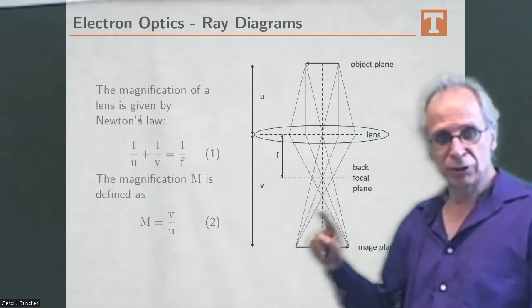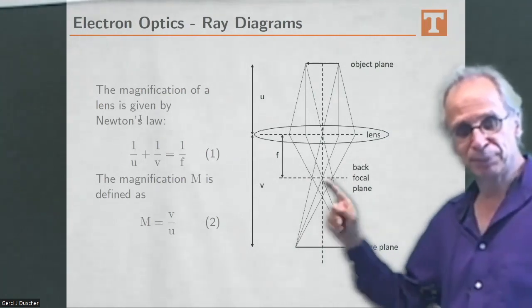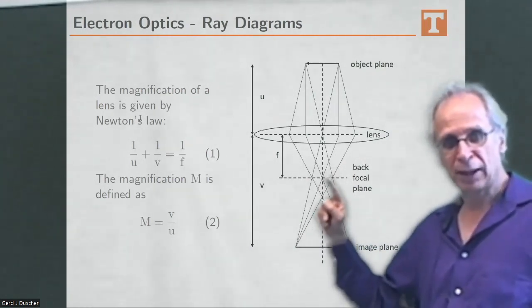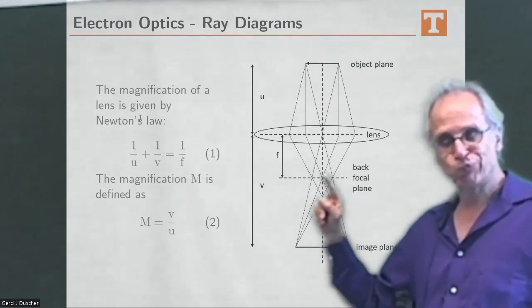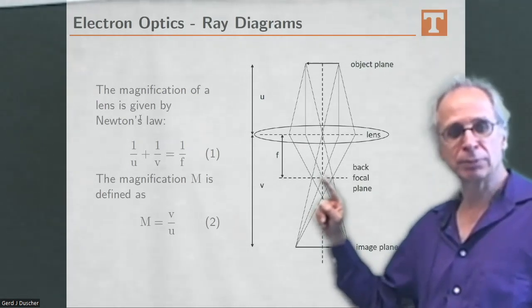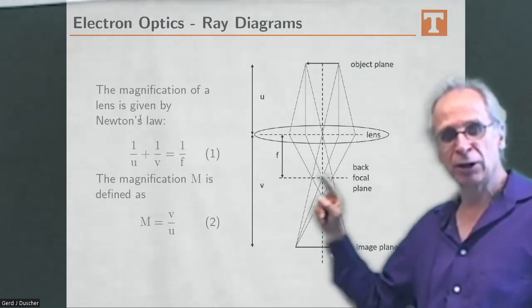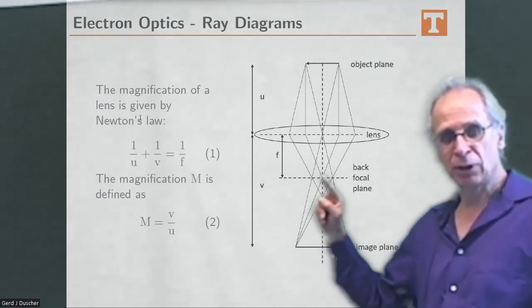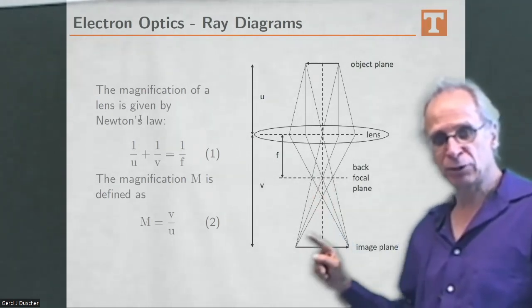Here there is also convolution for imaging. So we usually put all our instrument characteristics and convolute them when we go from the diffraction pattern down to the image.